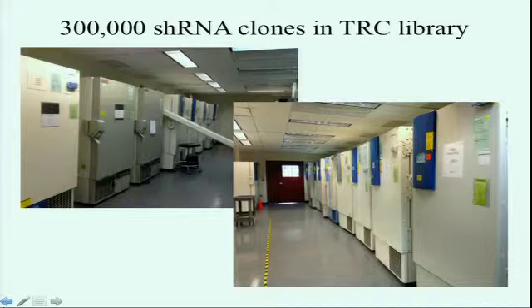So everything in our shRNA library and also our ORF library are housed in -80 and -40 degree freezers. This includes master bacterial stocks and also our DNA stocks as well. We always have a master copy that we have archived, and also a couple other copies just as backup in case something was to happen in one of our lab processes. We always like to have backup and safety measures.